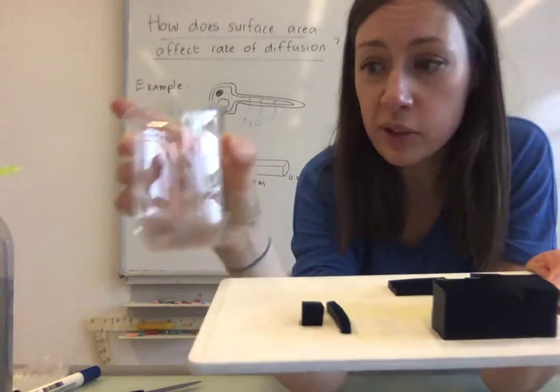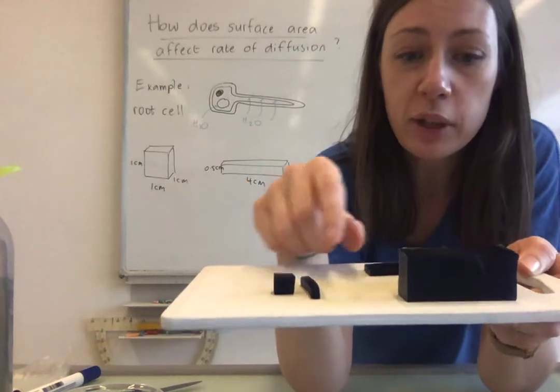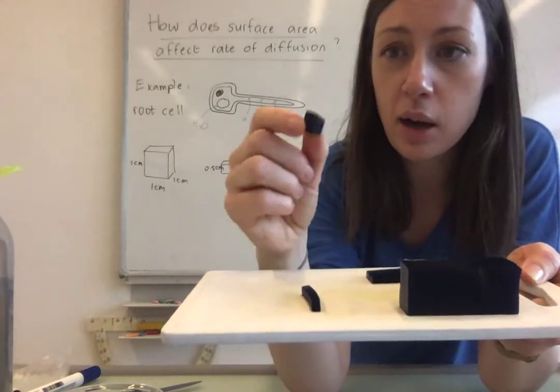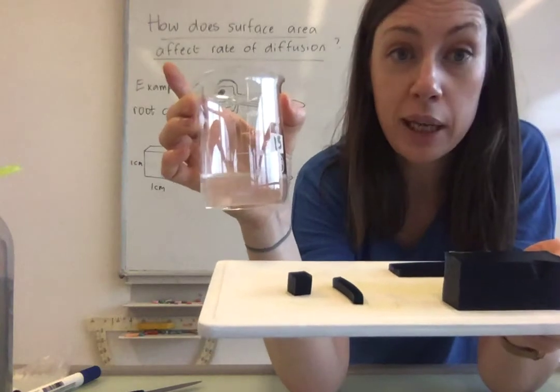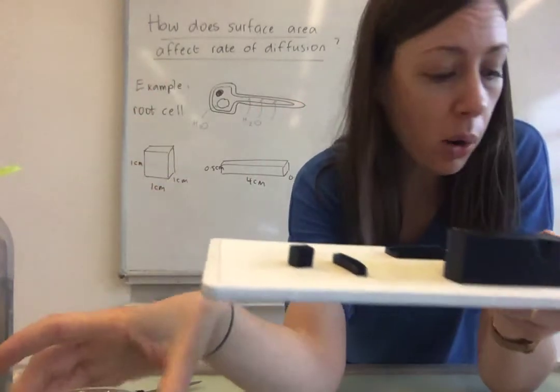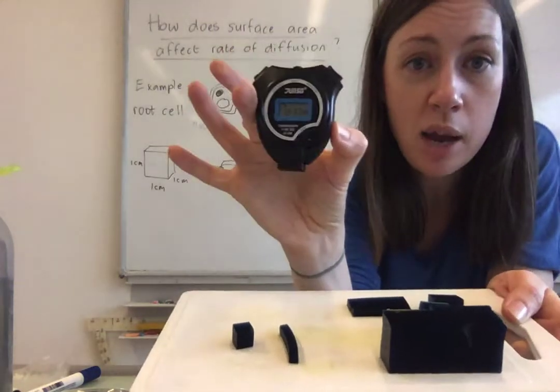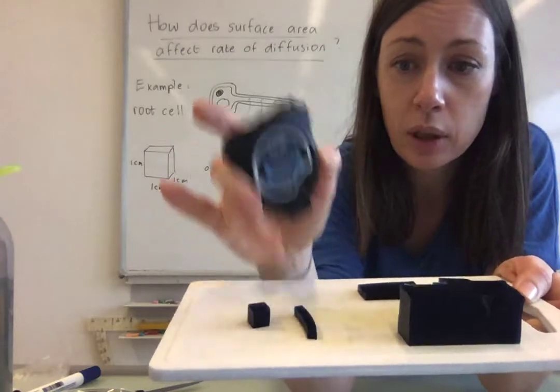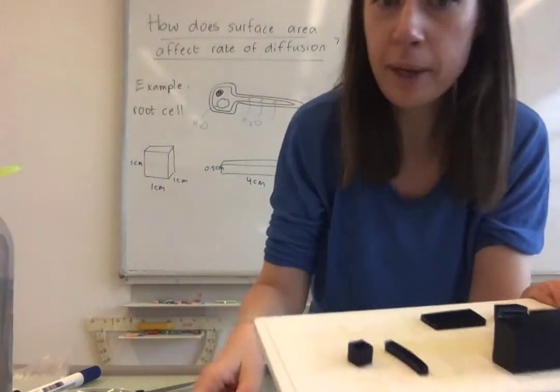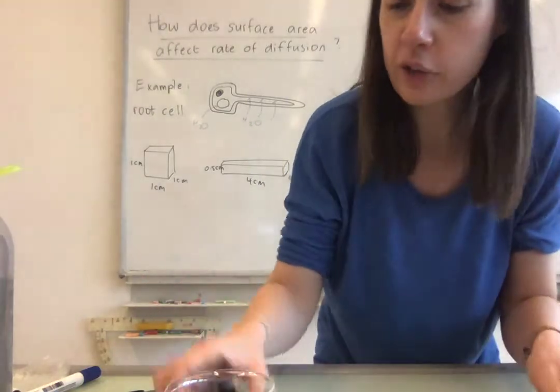And you're probably still thinking what am I measuring? Well I'm going to measure the time it takes for these to change color because when I put the agar in the vinegar it will start to change color from blue to yellow. We're going to measure the time it takes for the whole thing to change color. So I'm going to put them in and start my timer.